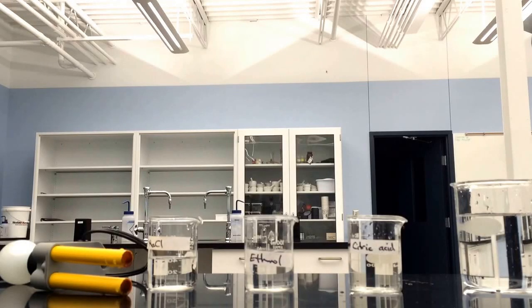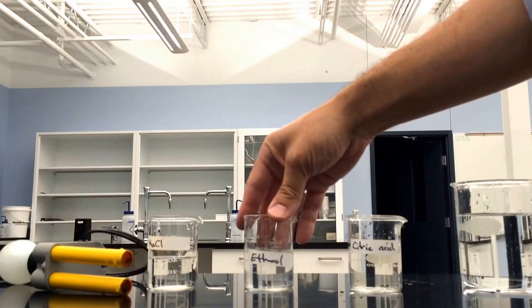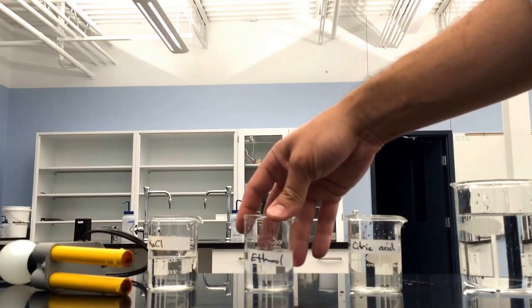Today in class we saw that there are two major groups of compounds, the ionic compounds and molecular compounds. And the way we test for them is that ionic compounds like sodium chloride will conduct electricity when they're dissolved in water because that releases ions into the solution. The molecular compounds do not, so we're going to use ethanol as the example of that.